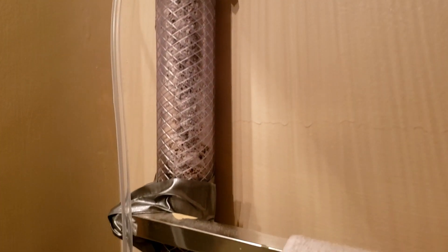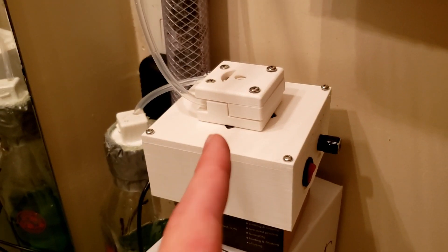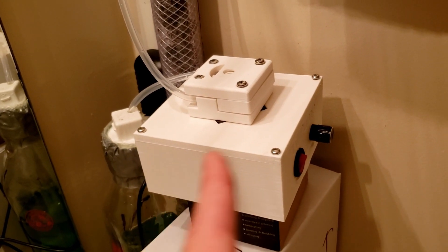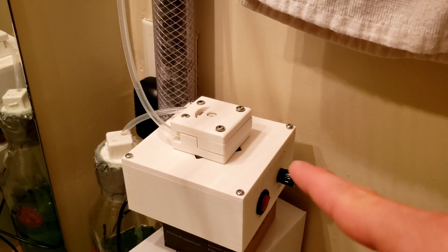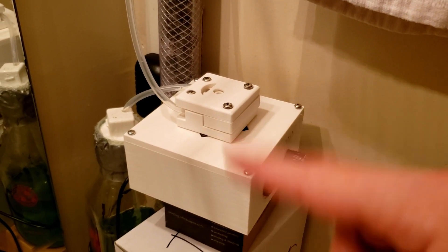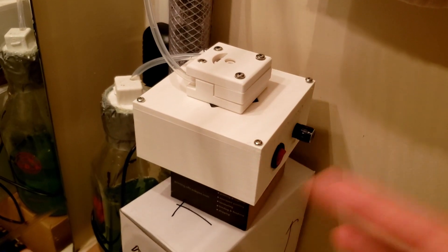I haven't seen any contamination in the tube over the last 10 days, so that's good. The liquid drips down the tube and into the collection jar so we can compare colors. The lowest speed I got with this pump was 10 milliliters per minute. We want a residence time of 12 hours, and doing the math, that means about 0.4 milliliters per minute — so 10 mils per minute is a lot more. However, with the larger pump head and head pressure involved, hopefully we can get down to about 1 drop per rotation, around 1 mil or half a mil per minute.